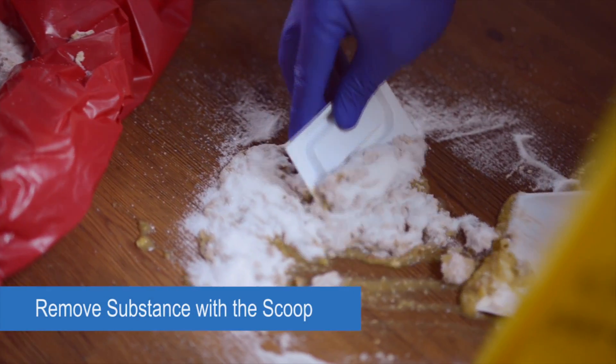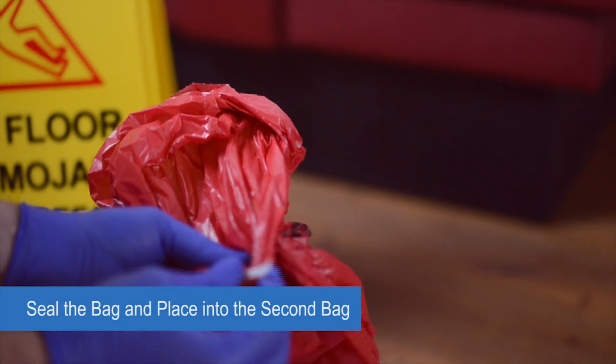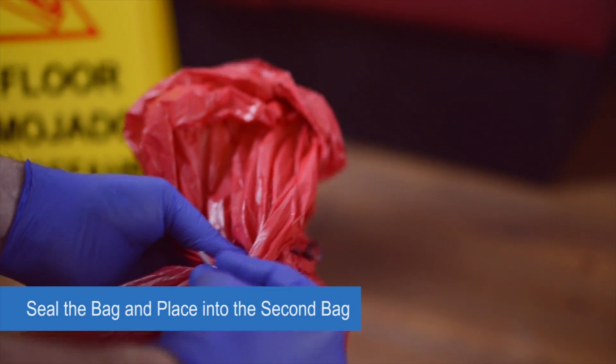Remove the gelled substance with the scoop and scraper and place it in a red trash bag. Seal the bag tightly and put it into the second red trash bag. Don't seal the outer trash bag just yet.